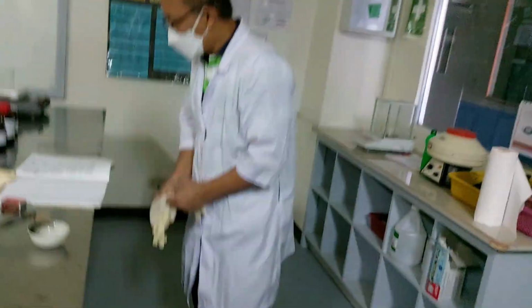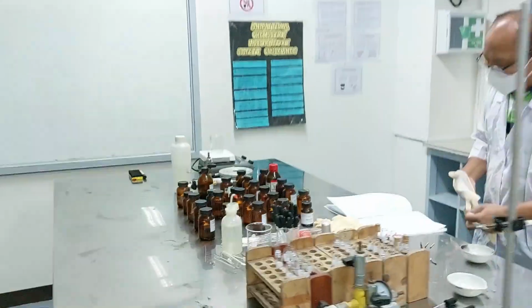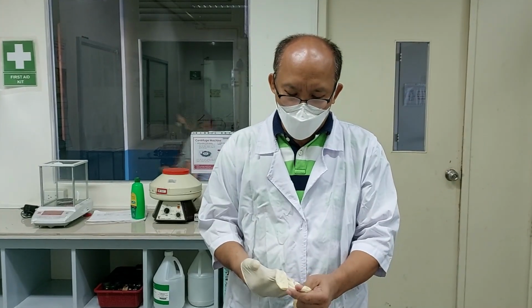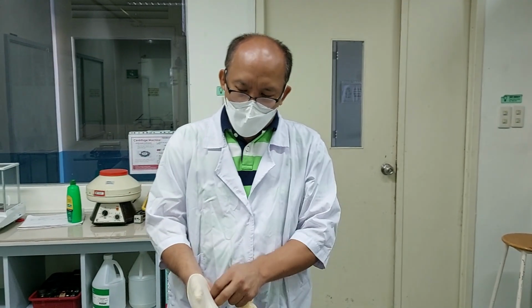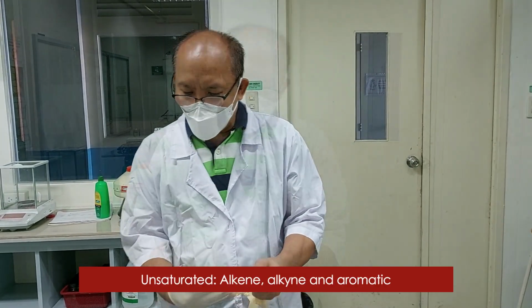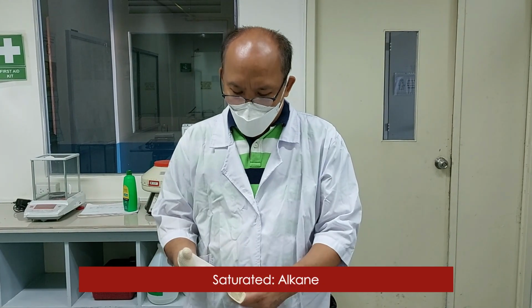Okay, so now let's move on to the test for the presence of double bond. We have defined unsaturated and saturated hydrocarbons, right? Unsaturated would be alkenes, alkynes, and aromatic, while saturated would be the alkane.